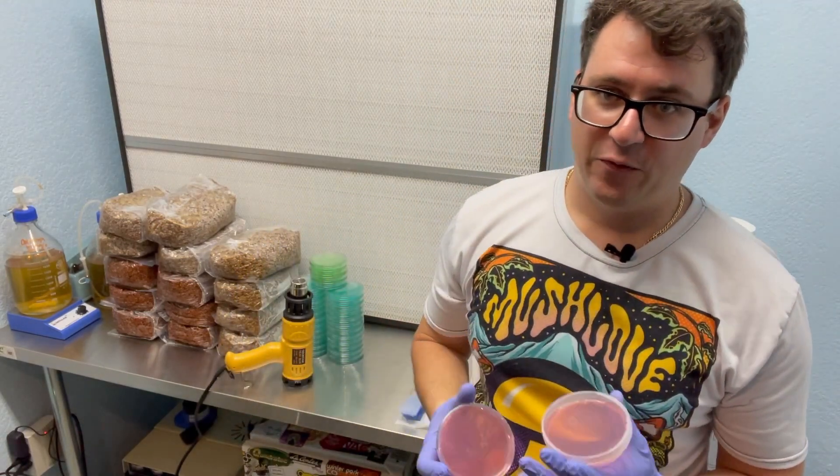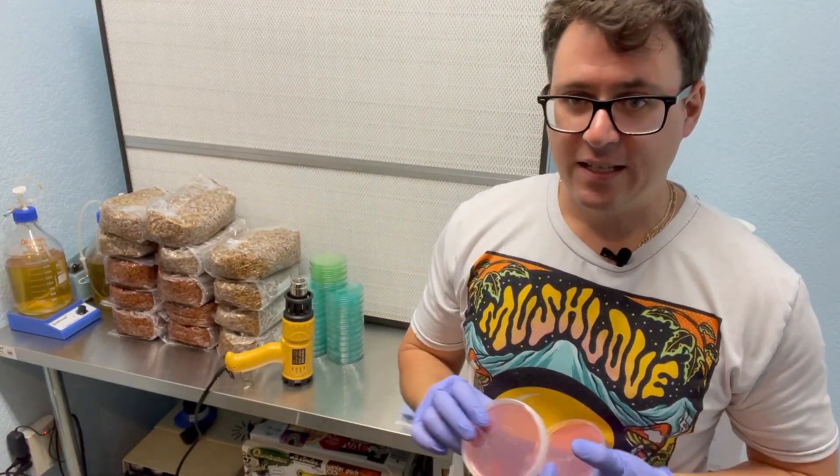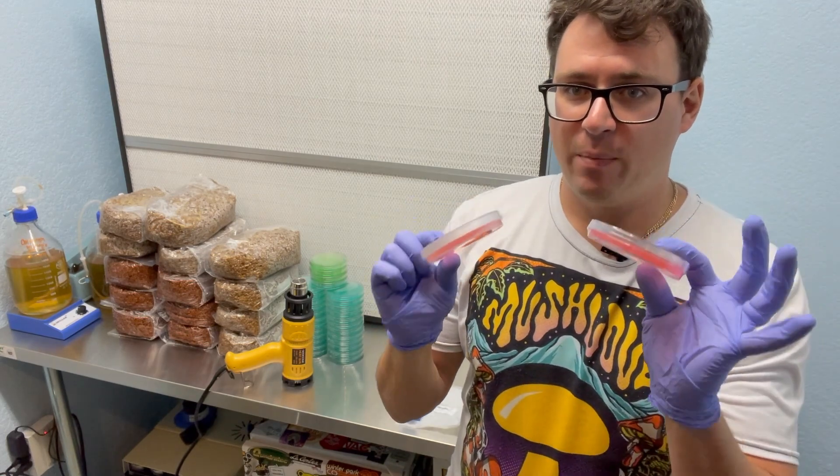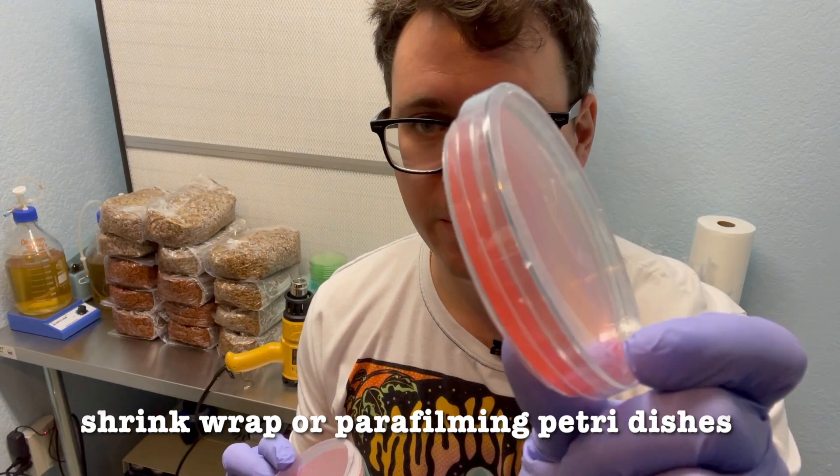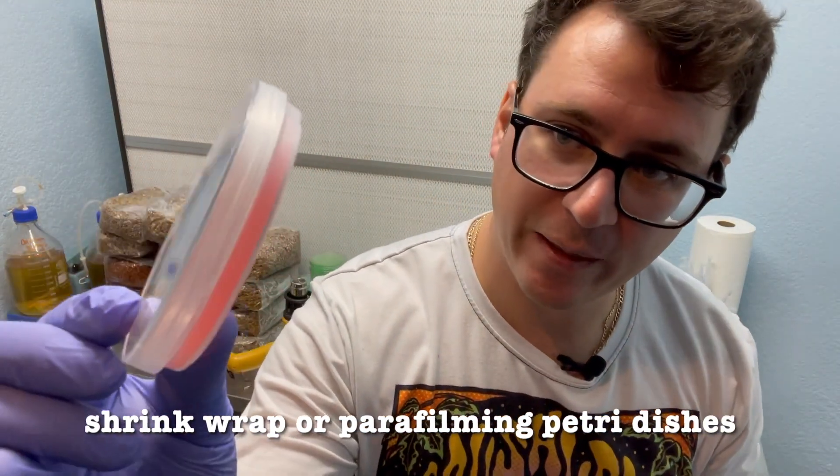What's up everyone? It's Gary with Fresh From the Farm Fungi. Today I wanted to talk about the differences between shrink wrap and parafilming sterile petri dishes.